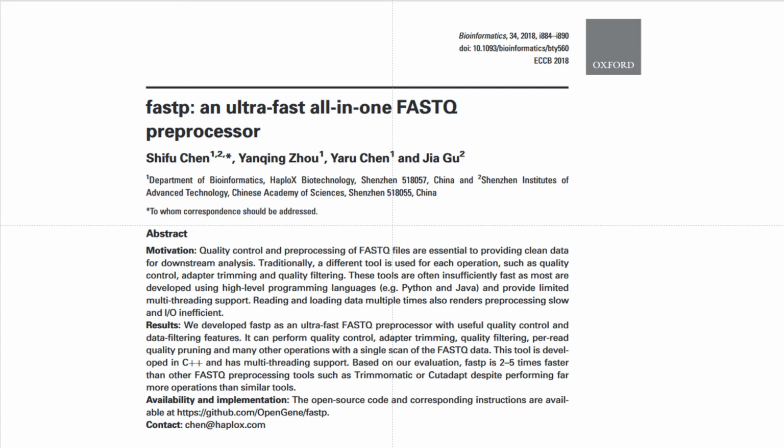Later on, maybe we'll go back through. This is really interesting to me, fastp, and that's from 2018. Where did I see that? Yeah, 2018, whereas Trimmomatic is from 2014. So maybe this could be the next up and coming thing.